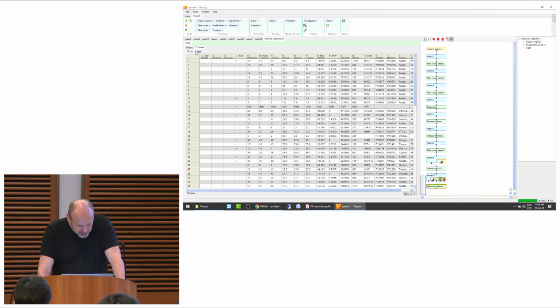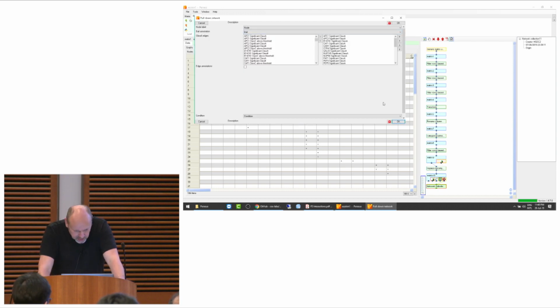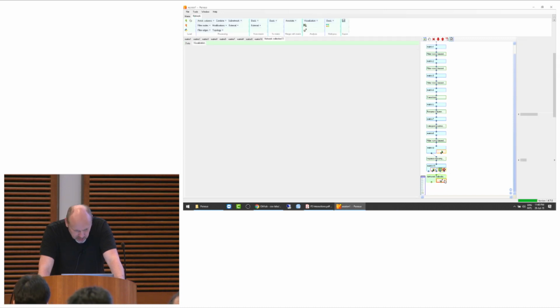And as networks are, you have a node list and you have an edge list, right? The nodes are basically all the baits and all the interactors that were found, so class A and class B. And the edges are saying what is interacting with what in this network, basically, right? So that's already actually the network information. So now you have the interaction network, you're done, basically, right? But you can also view the network information here.